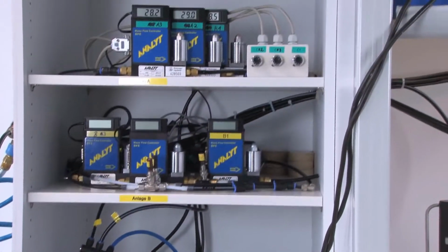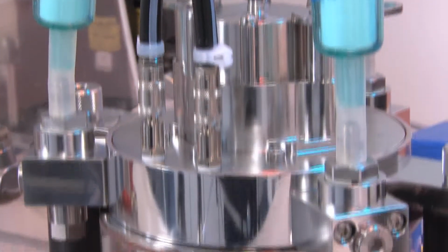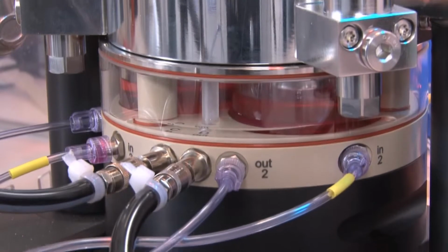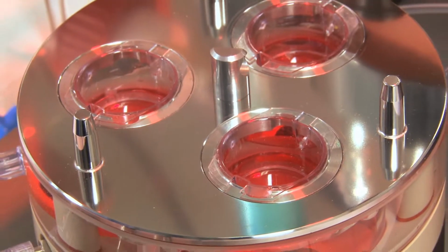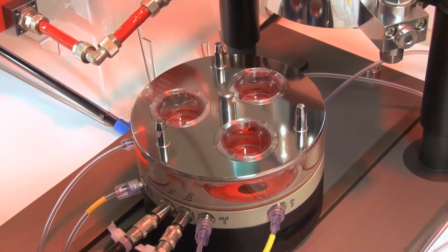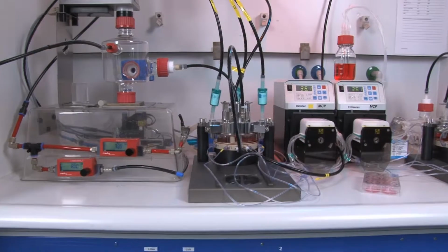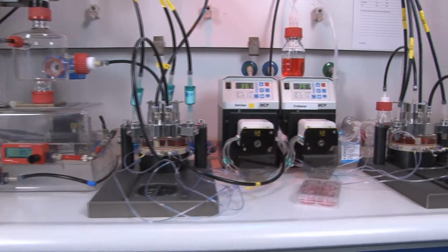The computer-operated generation of the test atmosphere provides a constant and controlled flow of particles. A necessary requirement for the CULTEX RFS to achieve optimum contact between the particle atmosphere and the cell cultures. The outcome is again reproducible results.